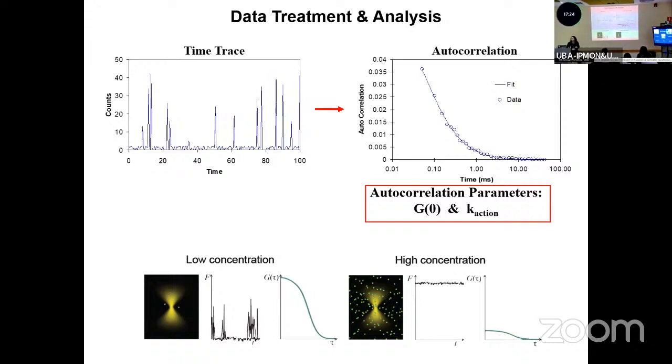And the autocorrelation function here is the function where we're, let's say, calculating the analysis of the fluctuation from one point in time and saying, is this the same molecule in the next point in time? And if they autocorrelate, if you have a high probability of seeing the same molecule in a very short time scale, and as you go further in time, you will no longer see that molecule, right?